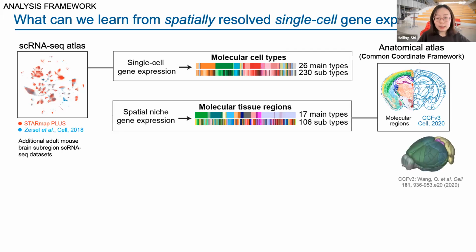The other aspect, to fully utilize the single cell spatial information, this analysis defines molecularly defined tissue regions. So we cluster the molecularly defined tissue regions from the gene expression of the cell and its physical neighbors.